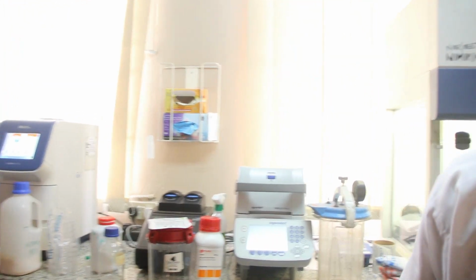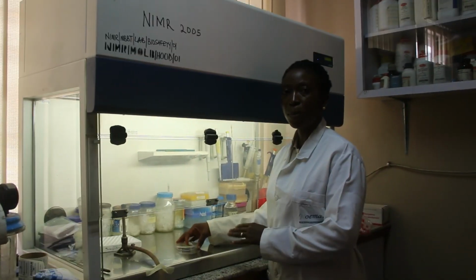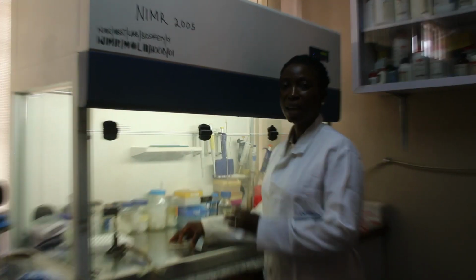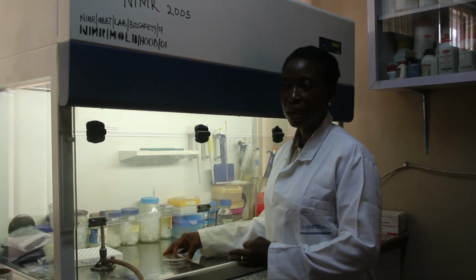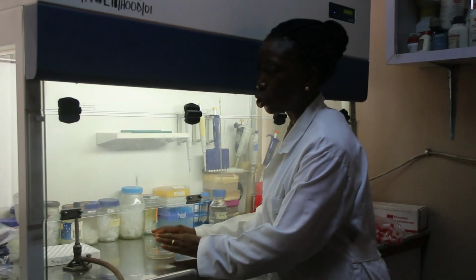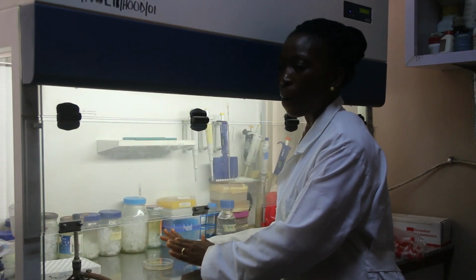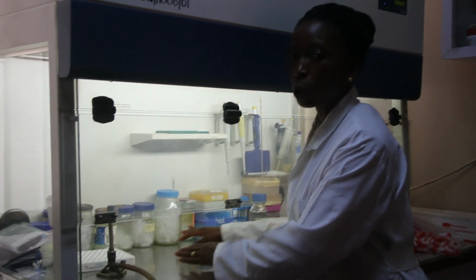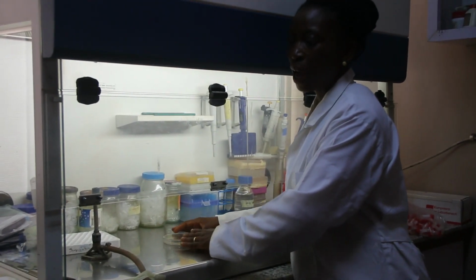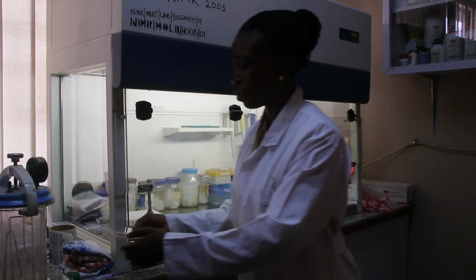The mixture will be poured under a biosafety cabinet after proper mixing of the Dent medium, the vitamin mix, and the horse serum. It is poured into the Petri dish under biosafety level 2. After pouring, there are bubbles. A flame will be used to remove the bubbles, and then the plates will be kept in the dark to solidify.